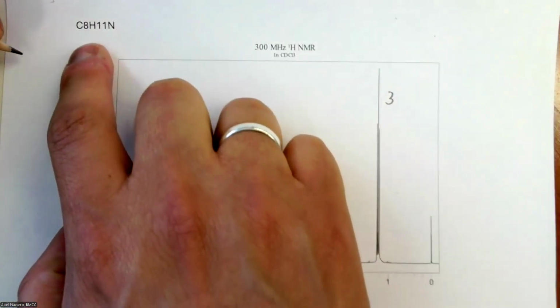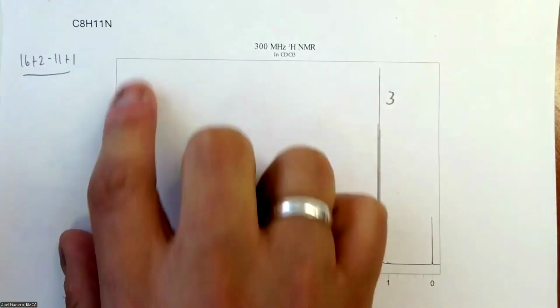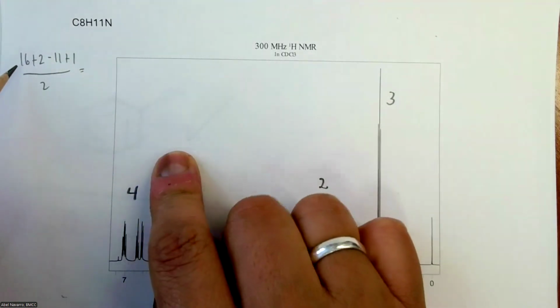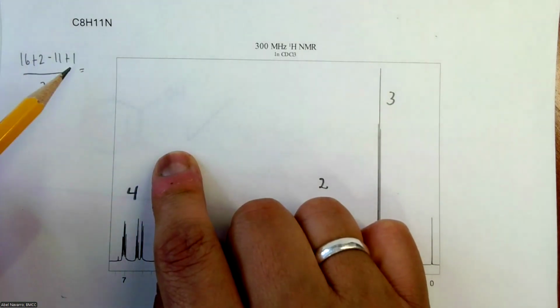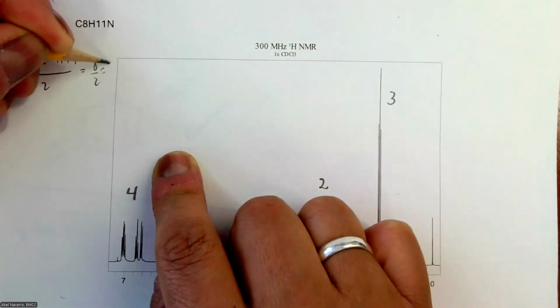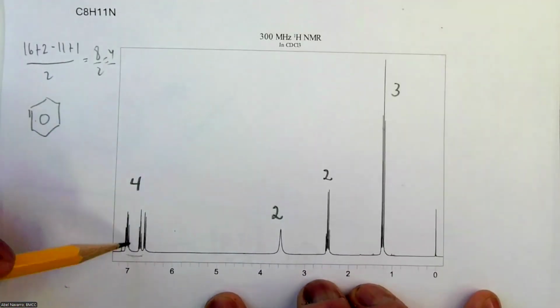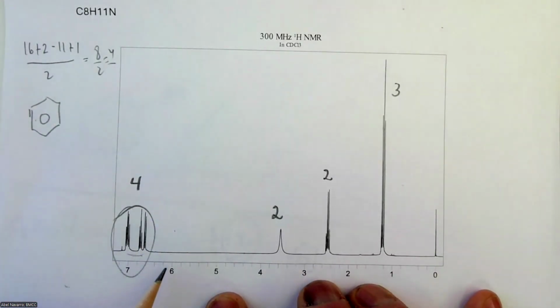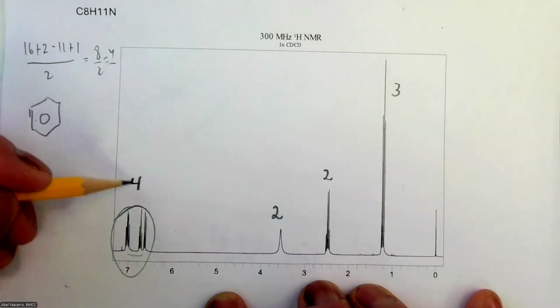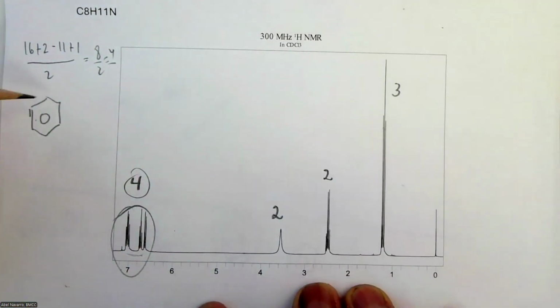Okay, C8H11N. So 2 times 8, 16, 16 plus 2 minus 11 plus 1. The plus 1 is because you have 1 nitrogen. So 16, 17, 18, 19. 19 minus 11, 8. 8 divided by 2, 4. Okay, benzene ring. Most likely have a benzene ring. And I can confirm that because I have peaks in the aromatic region. Remember, aromatic region goes from 6 to 8.5. So this is aromatic. Oh, but I see 4. That means that it is disubstituted, right? Because the benzene ring has 6 spaces. I have 4. That means it's 2 spaces.